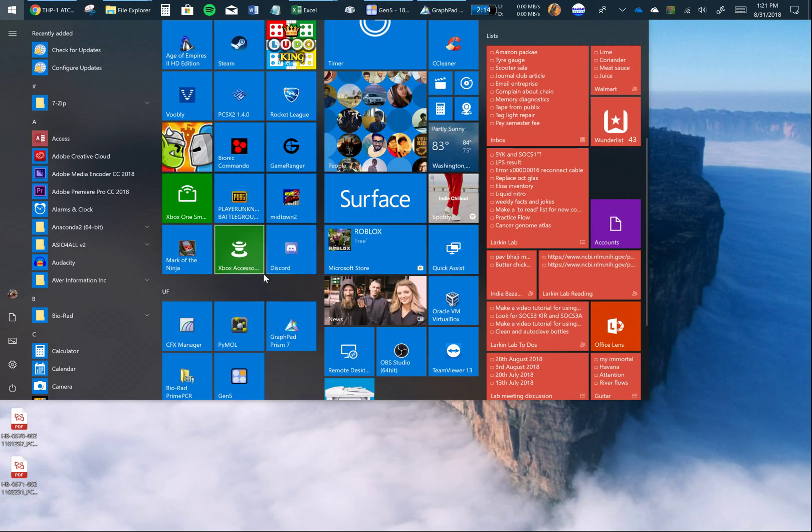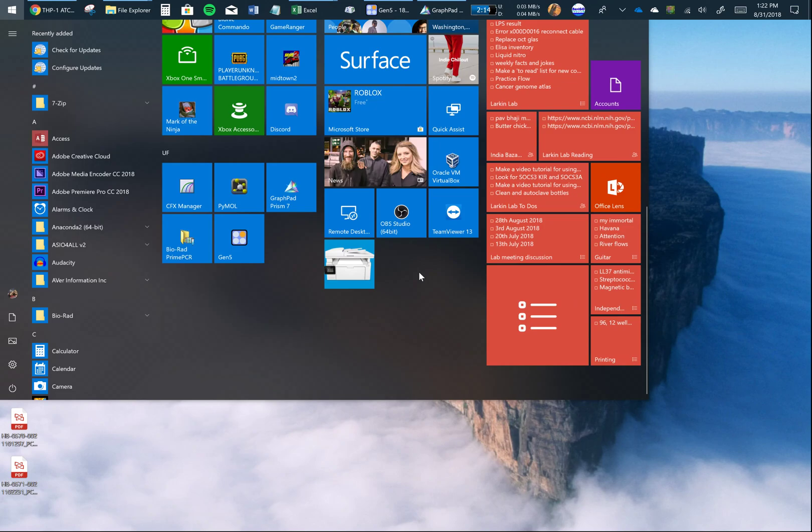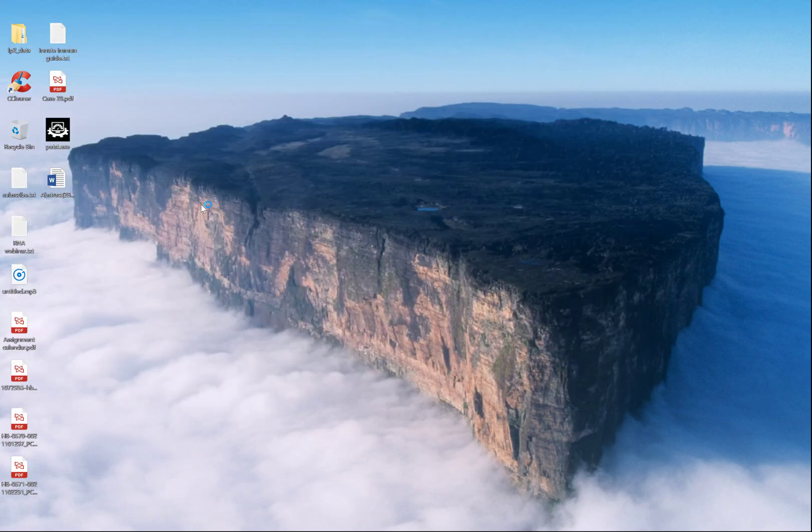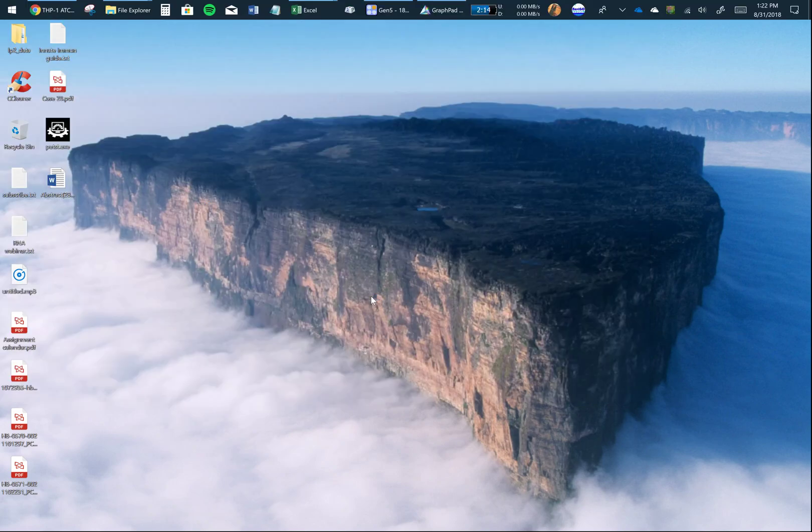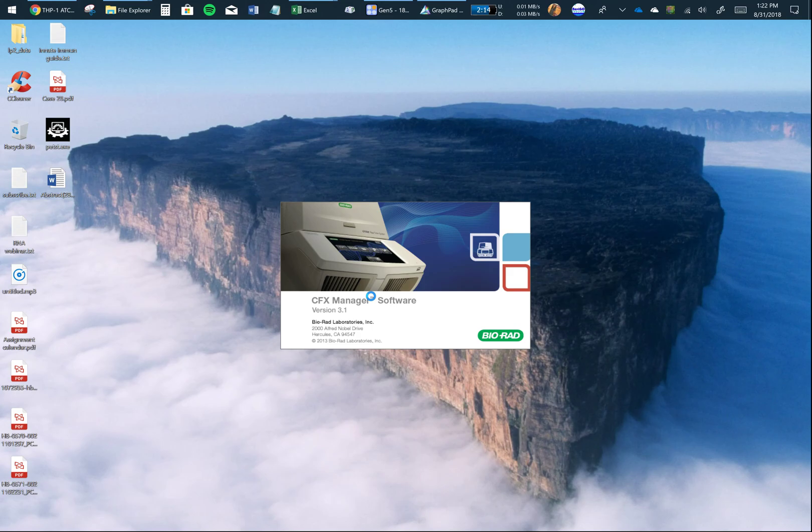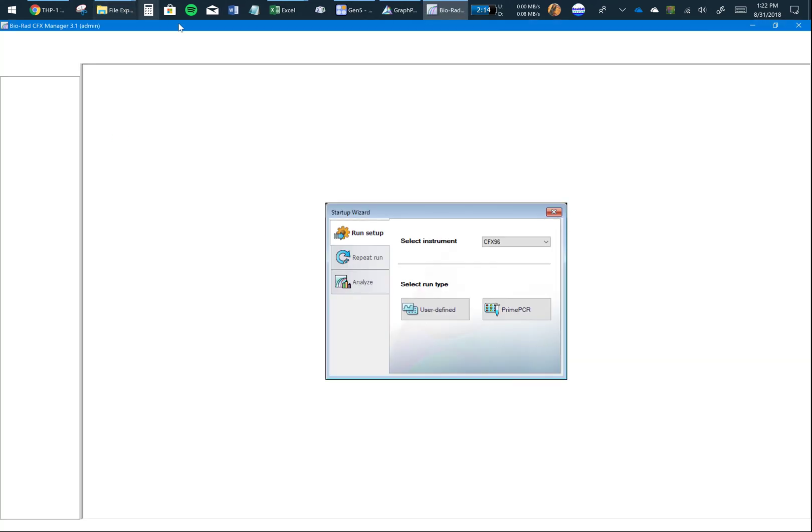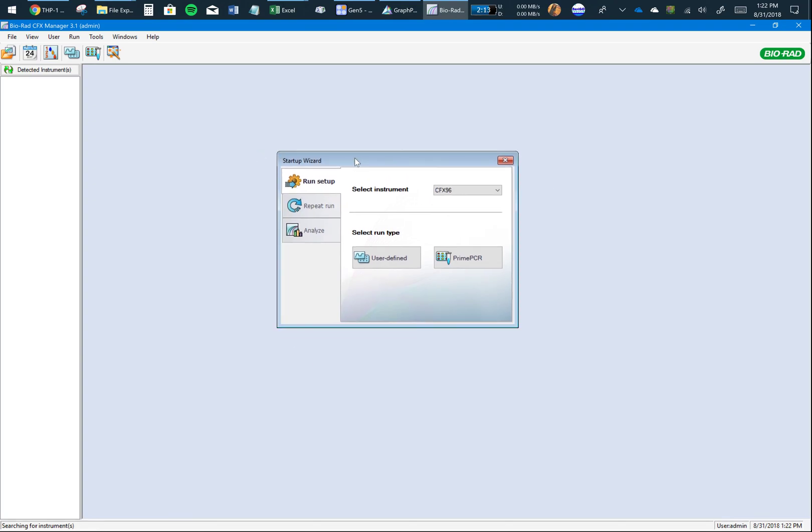Open the CFX Manager. Based on the computer you're on, the software might be on the quick launch or on the desktop. You'll see this window - click on User-Defined.